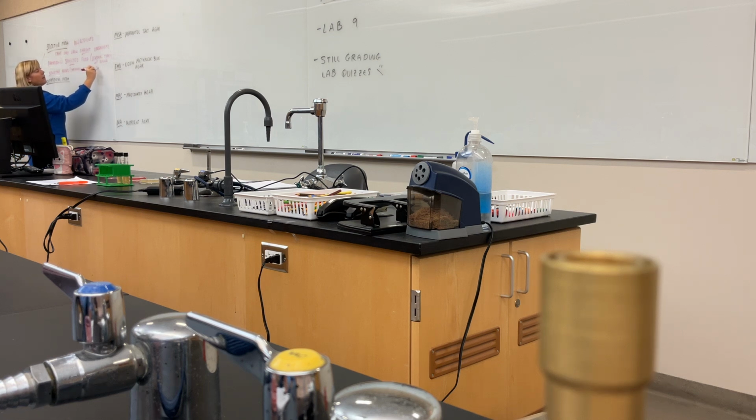It turns out that there are certain dyes that will kill gram-positives. The reason for that is because gram-positives have to build those thick peptidoglycan layers. When we have dye in a lot of different types of media, the dye gets in between the peptidoglycan layers and makes them kind of slippery and they fall apart. So it makes it a little bit harder to grow them. That would be an example of a selective media. It has something in it that makes it select certain organisms.